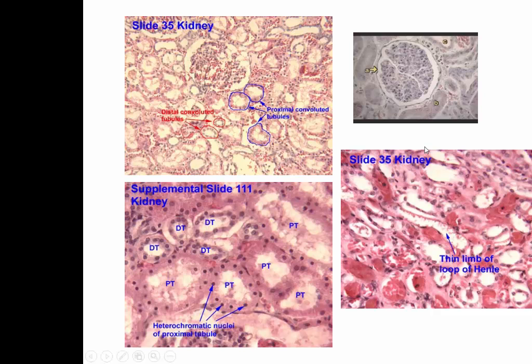So here's a slide showing some of these structures. If I look at this slide here, I can see the glomerulus is in the center. You can see the dark cells inside that have picked up the stain. And then you see the white, which is the space between the glomerulus and Bowman's capsule. So Bowman's capsule are these cells out here forming this outer edge of that capsule. And the space is just where the fluid would be held, right?